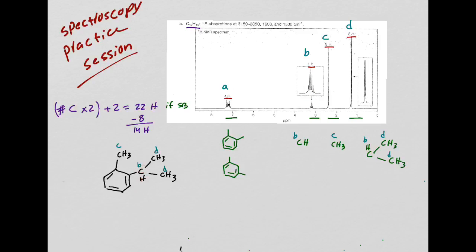And what type of splitting would you expect for this? On this side, it has no hydrogen. On this side, it has 1, 2, 3, 4, 5, 6. And since these two are equivalent to each other, this is key. Pay attention to this one.